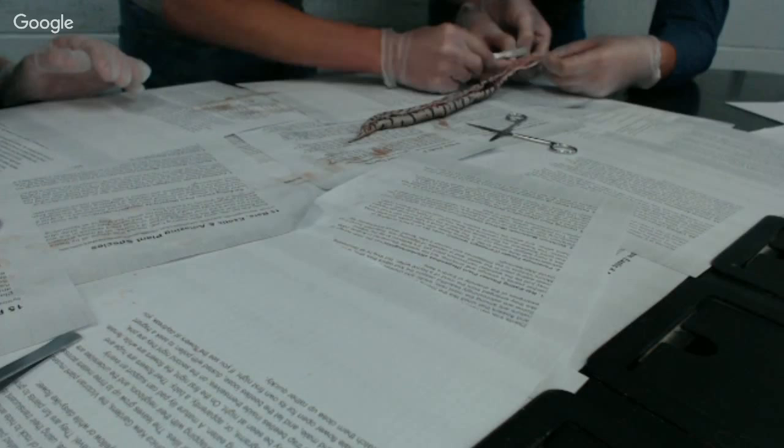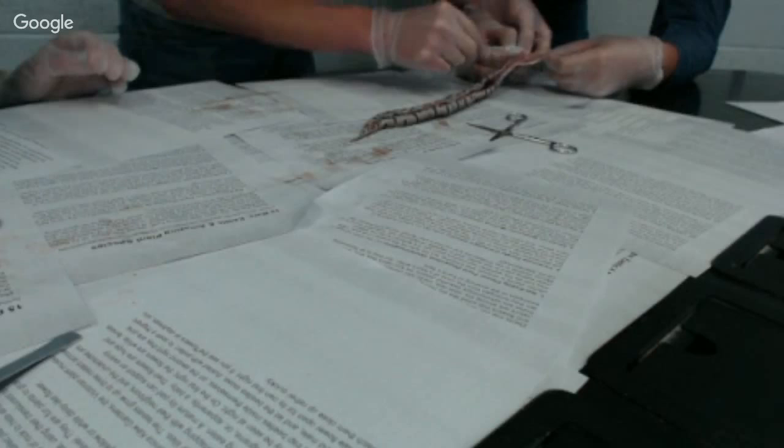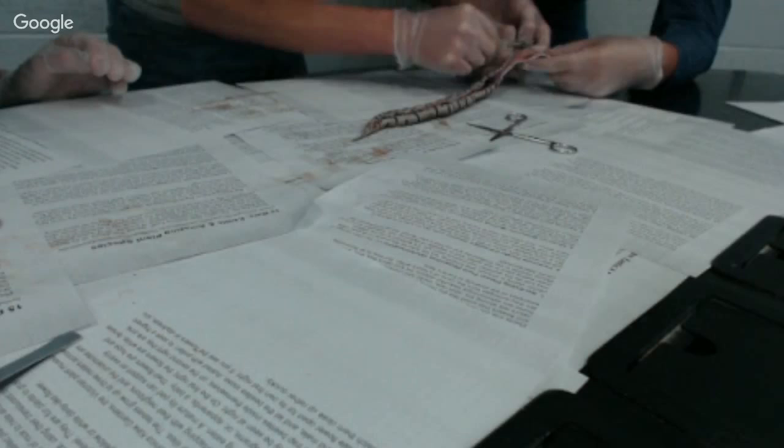You get this knife and you just start cutting. And then, after you get done cutting, you keep on cutting. That is like a little weird thing. That's why I wasn't getting away. I didn't notice. So we just cut down the sides? Yeah, you just gotta get... You can cut a little ways down the sides. And then cut all the way around. And then just grab the skin and pull it out.